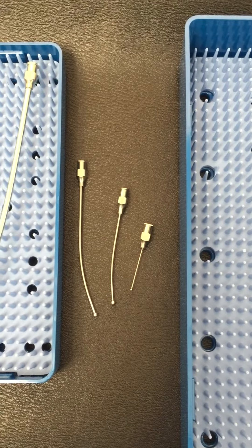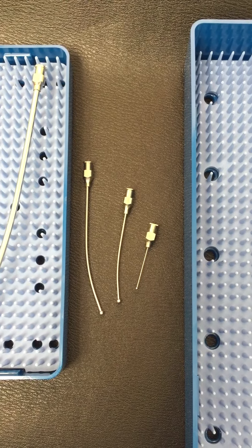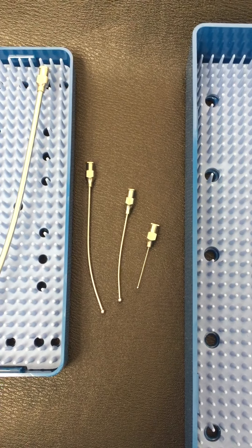Howdy friends, my name is Nick. I am with kawajneedle.com. Today I wanted to show you our reusable kawaj needles.